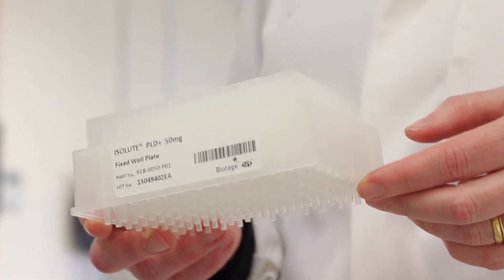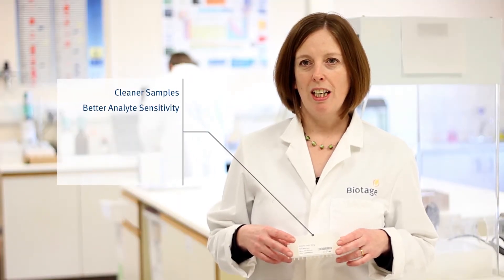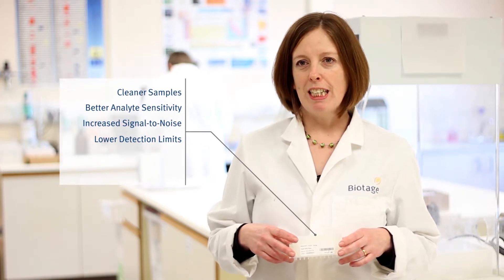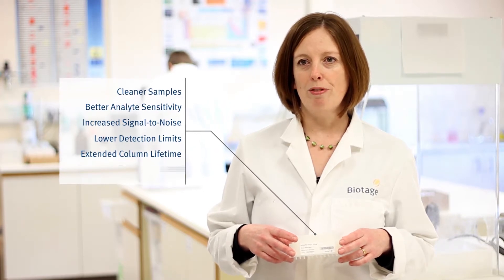This means that after a very simple sample prep step you can have cleaner samples, better analyte sensitivity, increased signal-to-noise, and lower detection limits. And because there's less dirt in your sample, you can also extend the lifetime of your LC column and avoid build-up in the mass spec source, so you don't have to clean it as often.